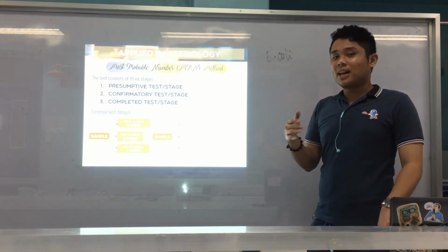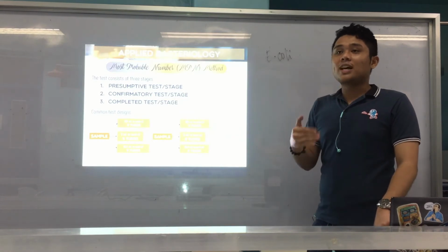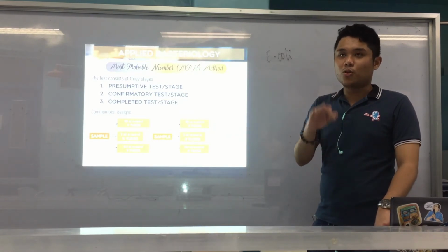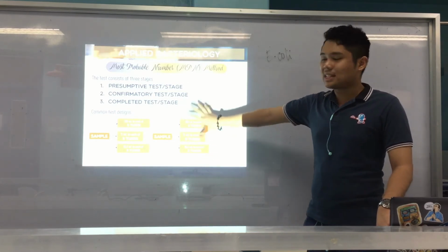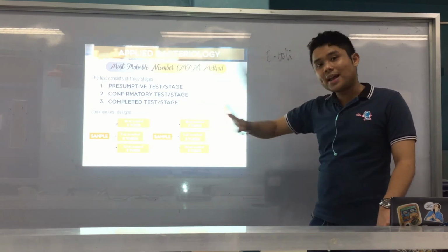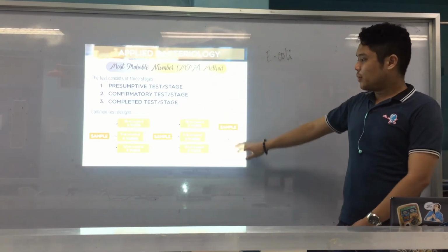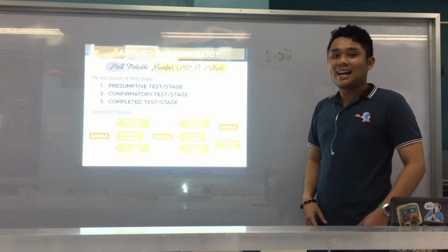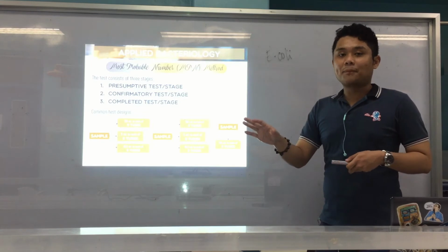Another design is the same, with the sample divided into 3 setups, but each setup contains 3 test tubes, so you use only 9 test tubes. It is still the same volume and 10-fold: 10 ml for the first setup, followed by 1 ml, and then finally 0.1 ml. And last, which is usually what we would do if we had lab class in person, is 10 ml to 5 tubes only.